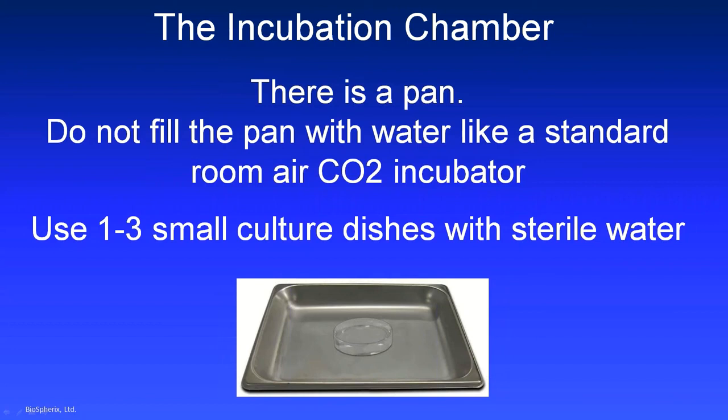Now there is a pan that's provided with each incubator, and this looks like the type of pan in a traditional room air CO2 incubator that you would fill with water. But I'm telling you, do not fill this pan with water like you do in that standard incubator. What you want to do is take a little dish and fill that with sterile water and see how long that little dish lasts you. If you need a second dish, add a second dish. Depending upon the conditions in your incubator, that may be all the water you need. You really don't need to fill that whole pan full, and there's lots of good reasons not to, and we'll go through that in a later unit.